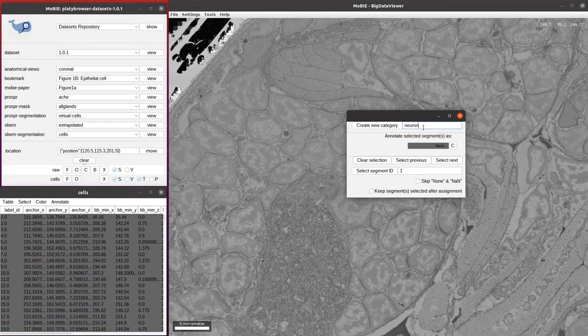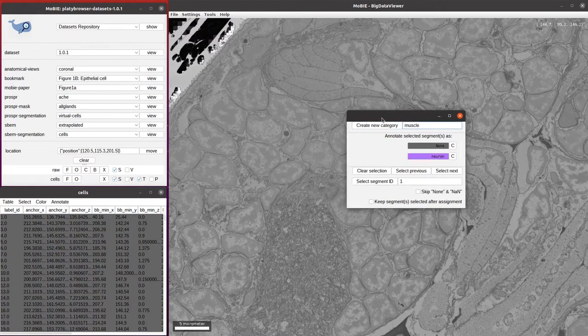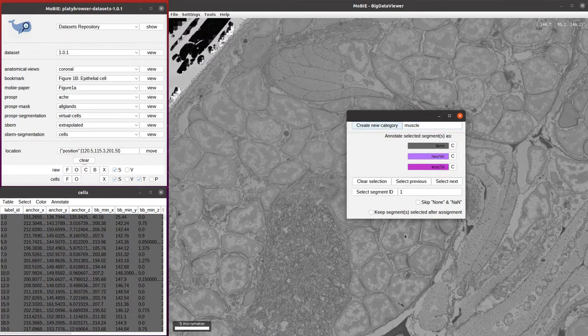We want one category for neurons. We just click to create that category. We want another one for muscles, and again, we click to create the category.